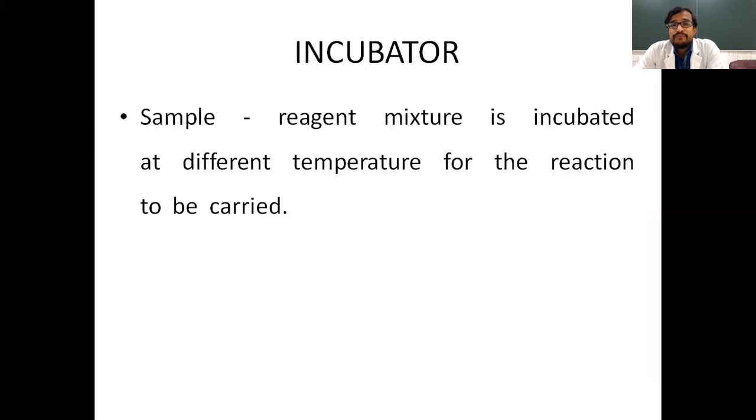Next, the incubator. We know in our routine laboratory we have done different experiments and we kept some of the samples at room temperature and some of the samples in a boiling water bath, which requires 100 degrees centigrade as incubation. Okay. Similarly, there are incubators in the laboratory. There is a temperature adjustment. It can be room temperature or 40 degrees or 60 degrees or 100 degrees, anything. But there is temperature adjustment in the incubator.